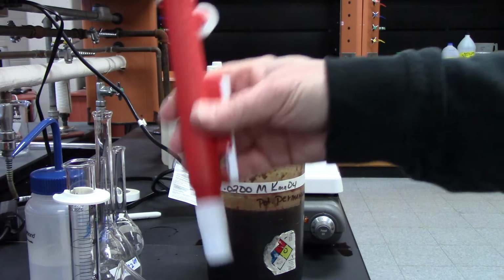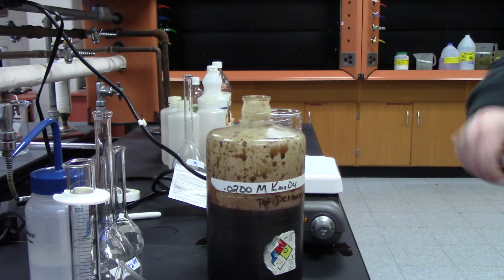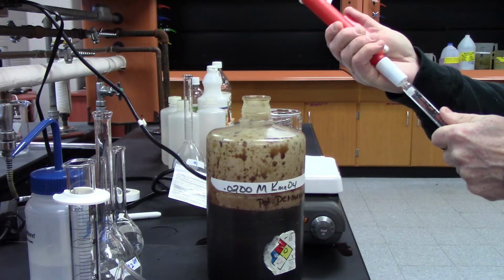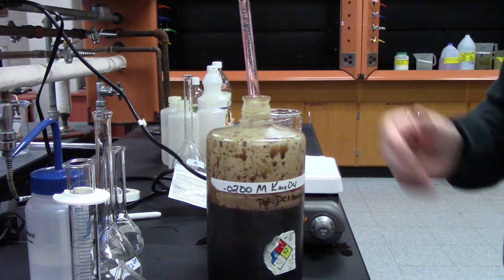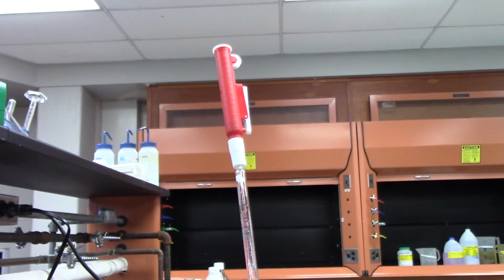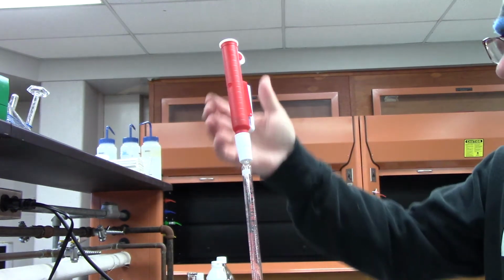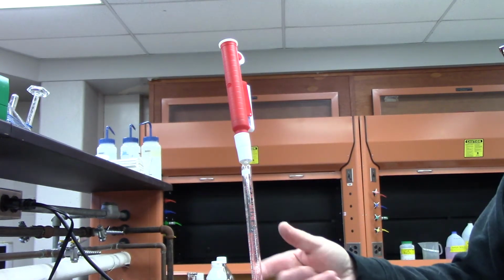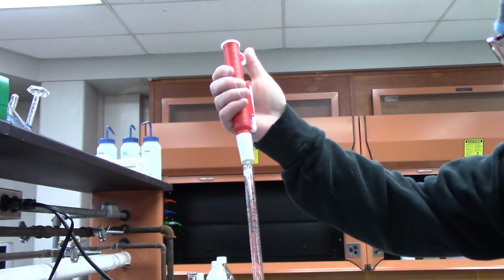Okay, so next thing is I got this guy here. This is called a pipette pump. Put that on the pipette. Okay, it's on there pretty good, which you want to do. All right, and then I'm going to put it in my stock solution. Now you see the wheel up on the top there. Now when I start rolling it down, it's going to start pulling the liquid up. It acts as a suction, and what I want to do is get it right to the top there because that's 25 mils.